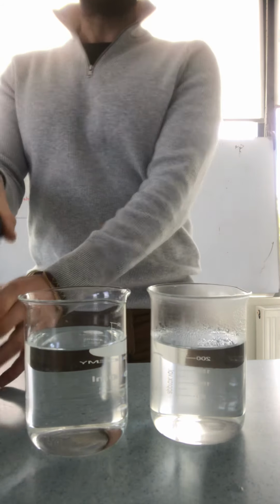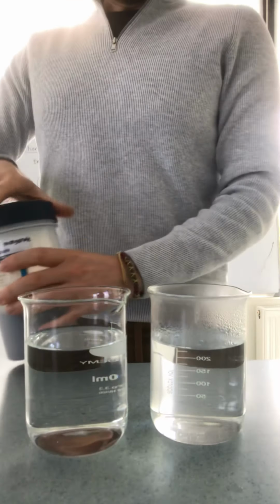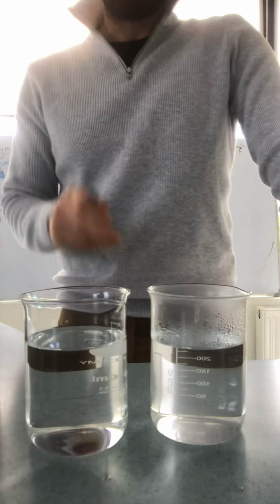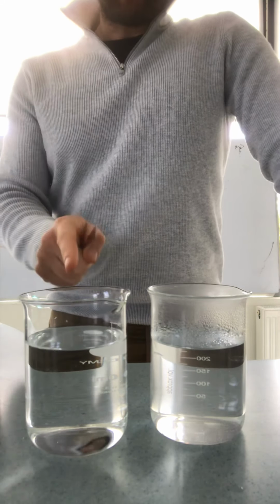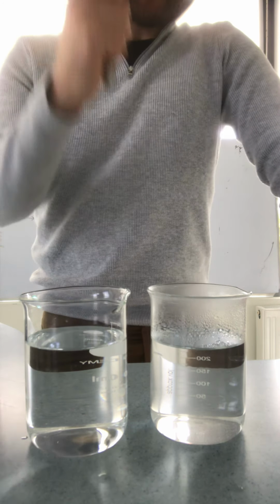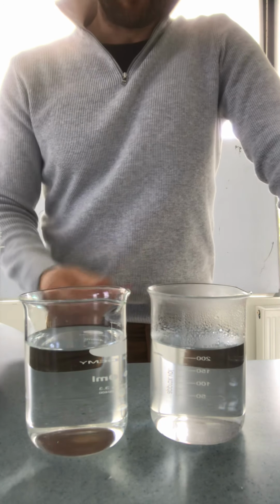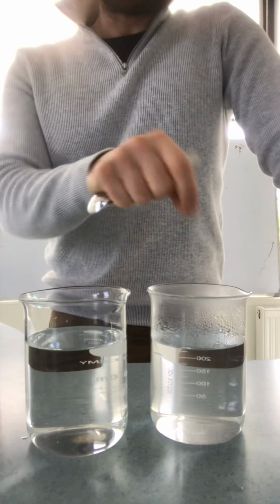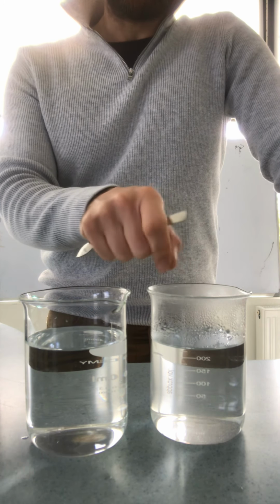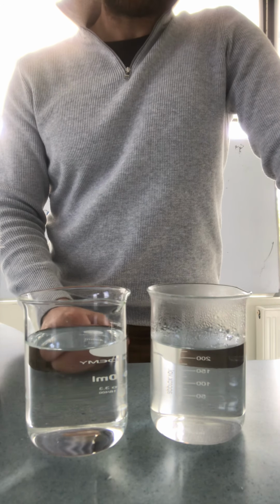What I've got here is this very useful chemical, potassium permanganate. Okay, and so that's potassium joined with manganese and with oxygen. So what I'm going to do is think about the actual movement of the molecules in here. Now remember, we would have talked about the fact that molecules in a hotter substance have a lot more energy. They're moving about a lot, and you can even see that if you put some dust into that, you will see the dust particles move around much faster, rather than in here where they will actually move a bit more slowly.